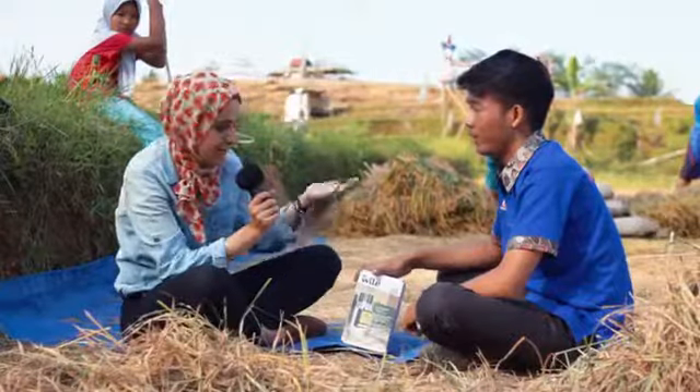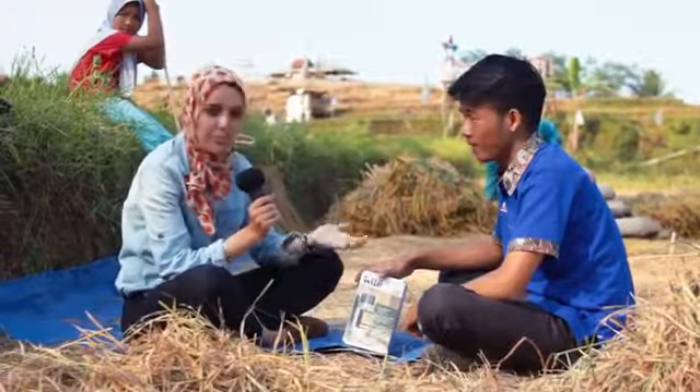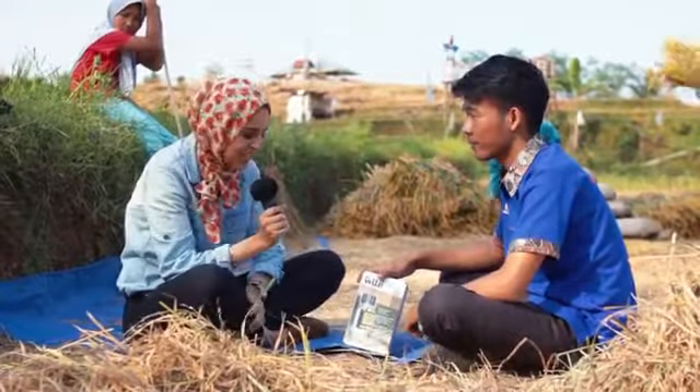Welcome back, sahabat. So right now we're going to get started and test the Wild 55 moisture meter.